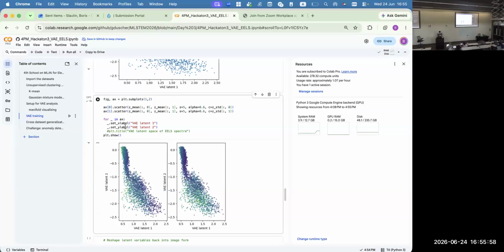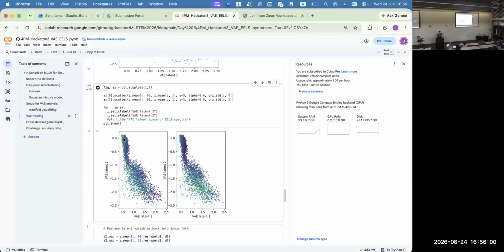Well, I just added this frame to visualize that the standard deviation for different latent variables is not a property that is often analyzed, at least in physics, but sometimes it can be a very important criterion to understand how well you can find your latent representation or how different parts of your data set are represented here.